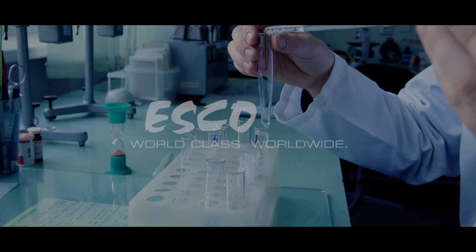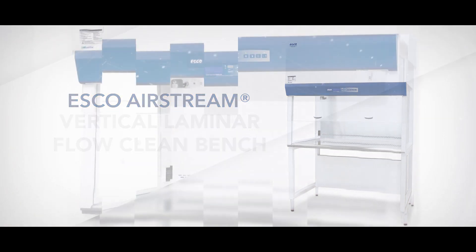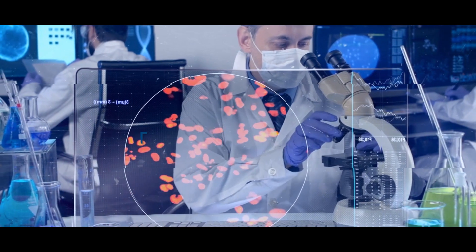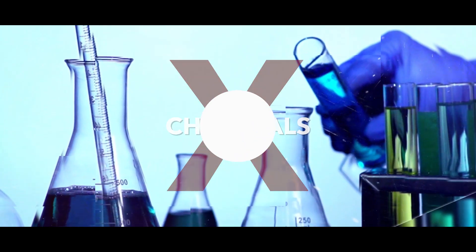The ESCO Airstream Vertical Laminar Flow Cabinet, also called a Laminar Flow Clean Bench or Hood, provides protection of products and processes through the continuous supply of clean, laminar air blowing across the work zone. It does not protect the operator and it should not be used when working with biological agents or chemicals.